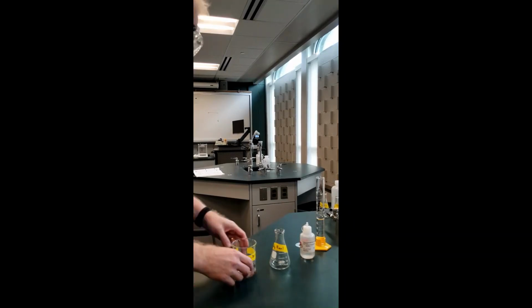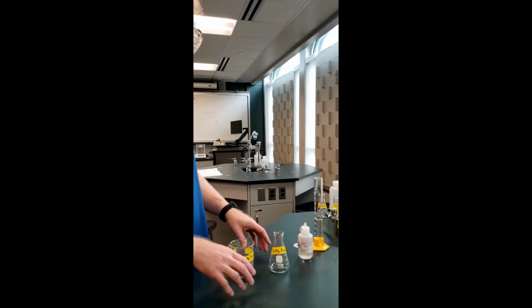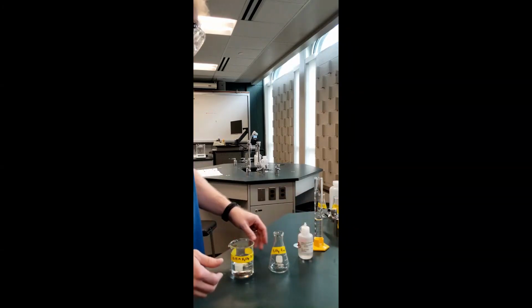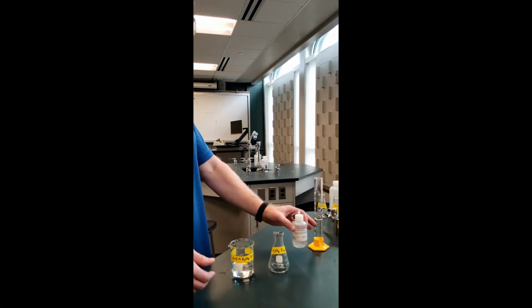So I'm going to prepare this sample for the sulfuric acid all at once. Normally you do all three. You know, you put in the sulfuric acid into 1, 2, 3, and then add the water, and then the phenolphthalein, or phenolphthalein, either way. This is the indicator. This is what's going to allow a color change to be seen and for you to know that the titration has ended.